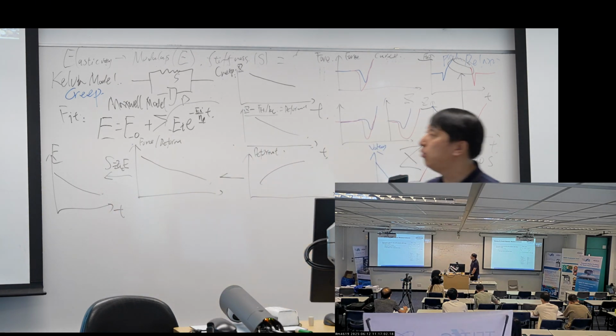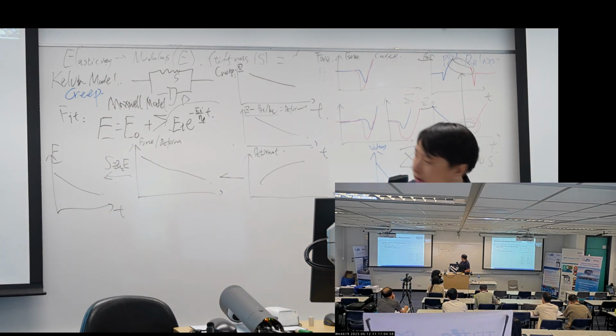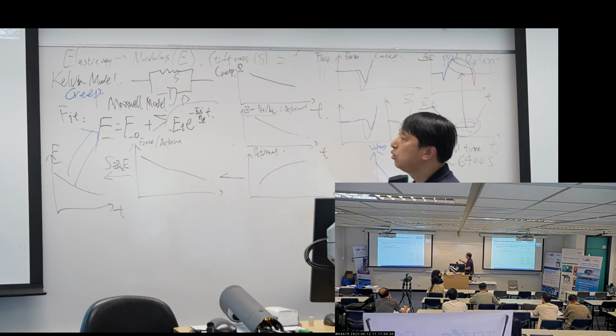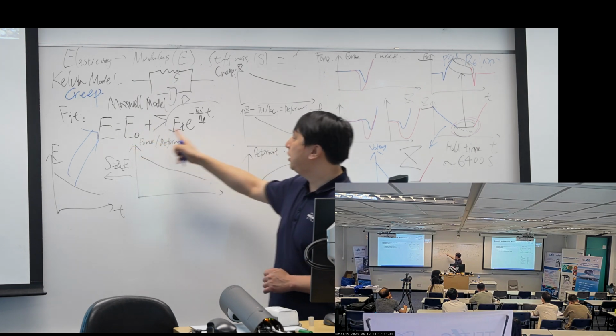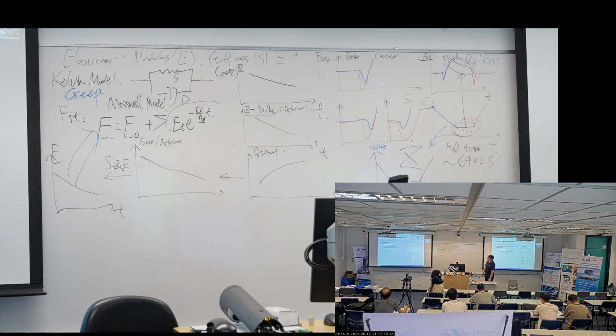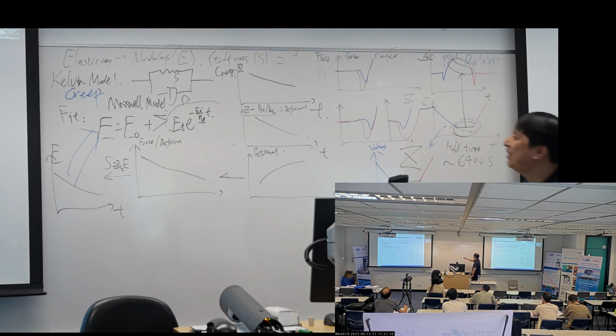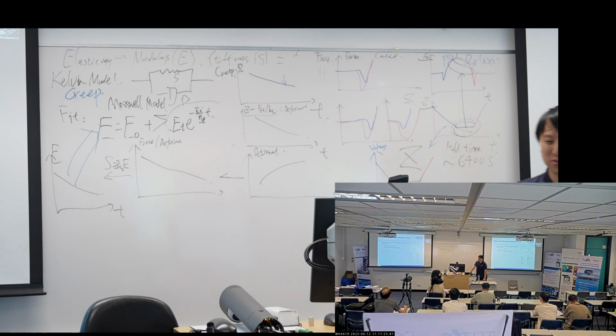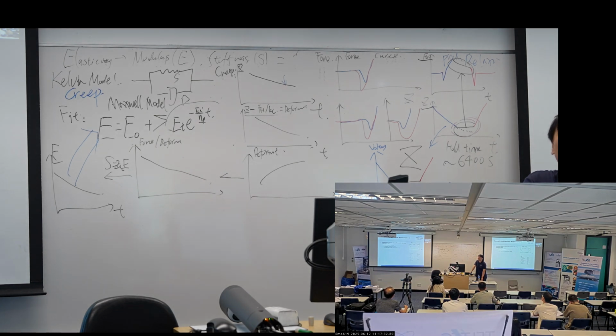So finally we reach here, and then we can do Maxwell fitting to get E0, E1, and E1 over eta. That's the final data processing step. I'm sorry, Bruker is lazy and they stop here and leave all the tasks to our users. So maybe Dr. Shi and Gordon, you can show the users this process and let them do it.